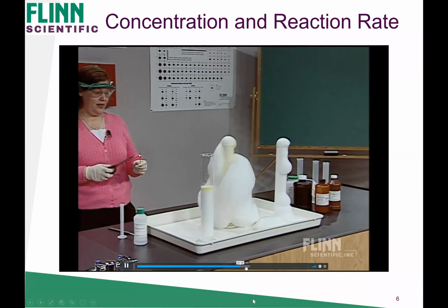So at this point, before we get into the results and really analyzing the results, I want to ask poll question 1, Dan, in terms of thinking about this experimental design. Could you put up poll question 1?